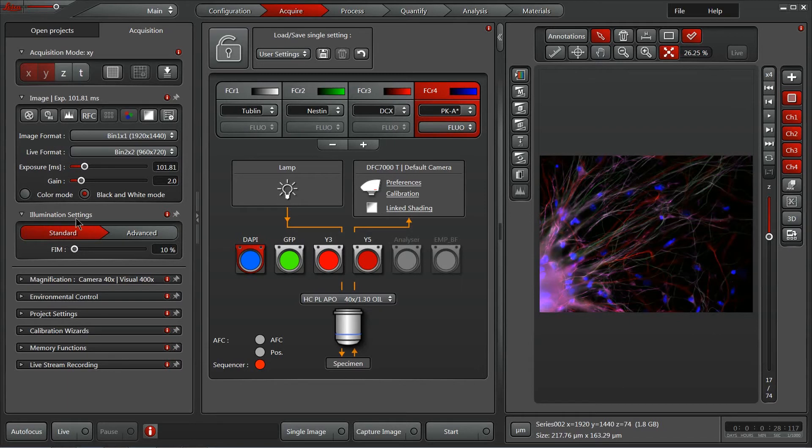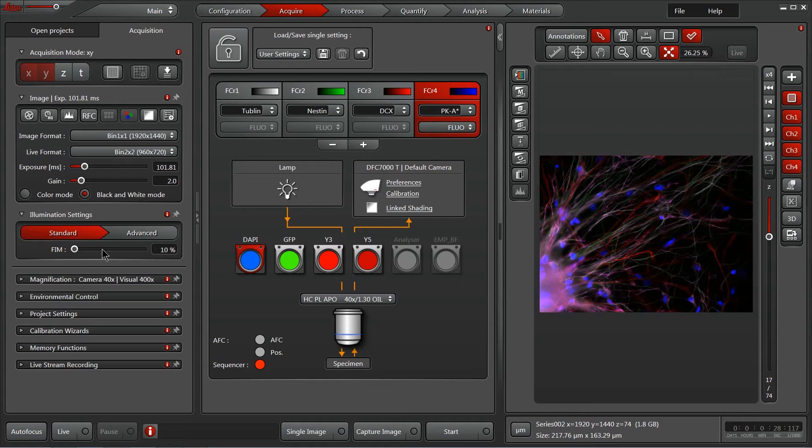Beneath that we also have our illumination settings. On this system, we've got some automated excitation control so I can control the amount of light that's hitting my sample.